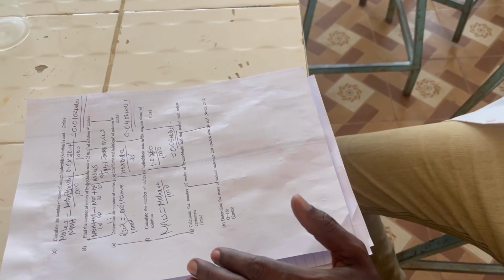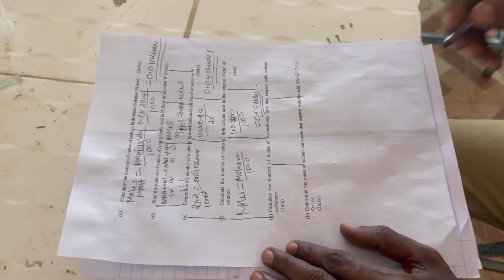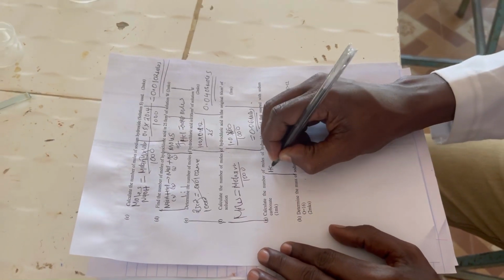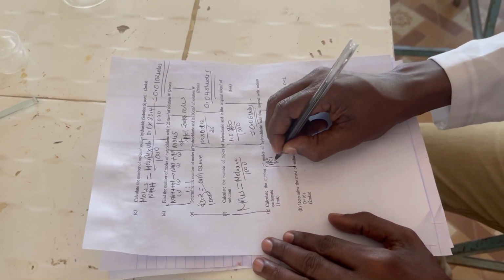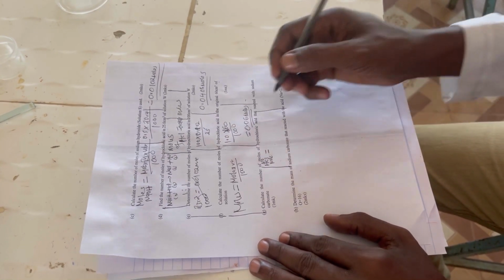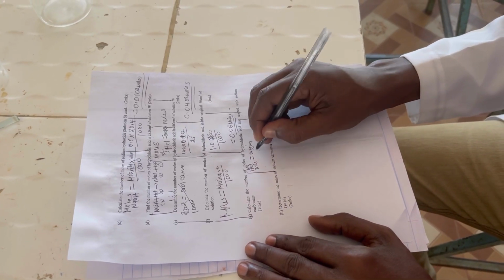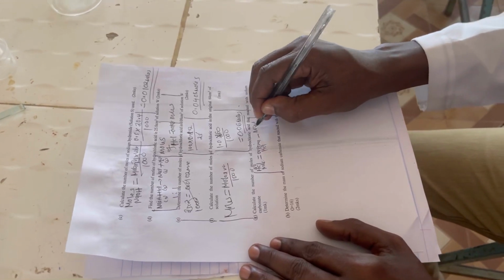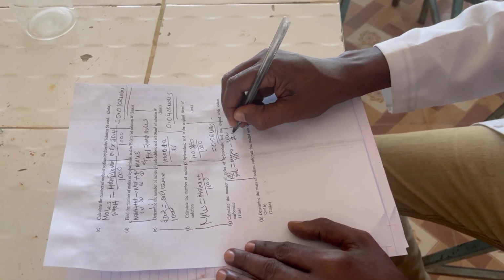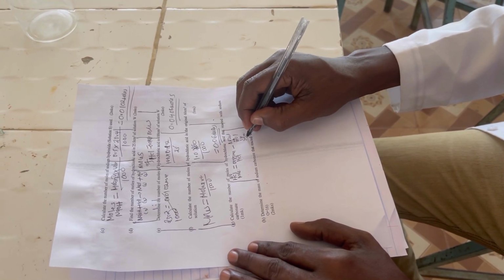So the number of moles of the hydrochloric acid that reacted with the carbonate will be equal to the original moles of the hydrochloric acid minus the moles of the hydrochloric acid in solution W.